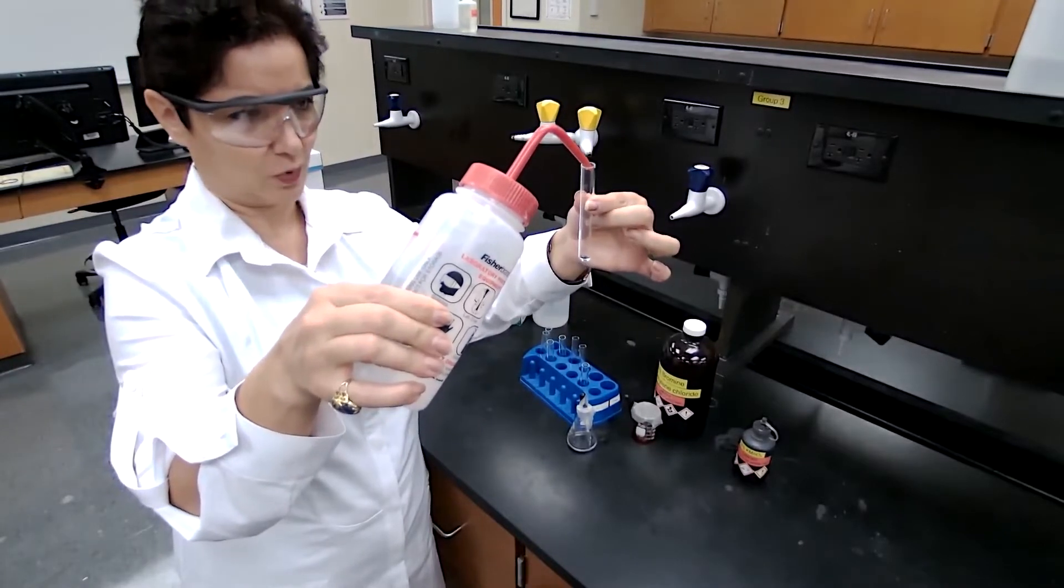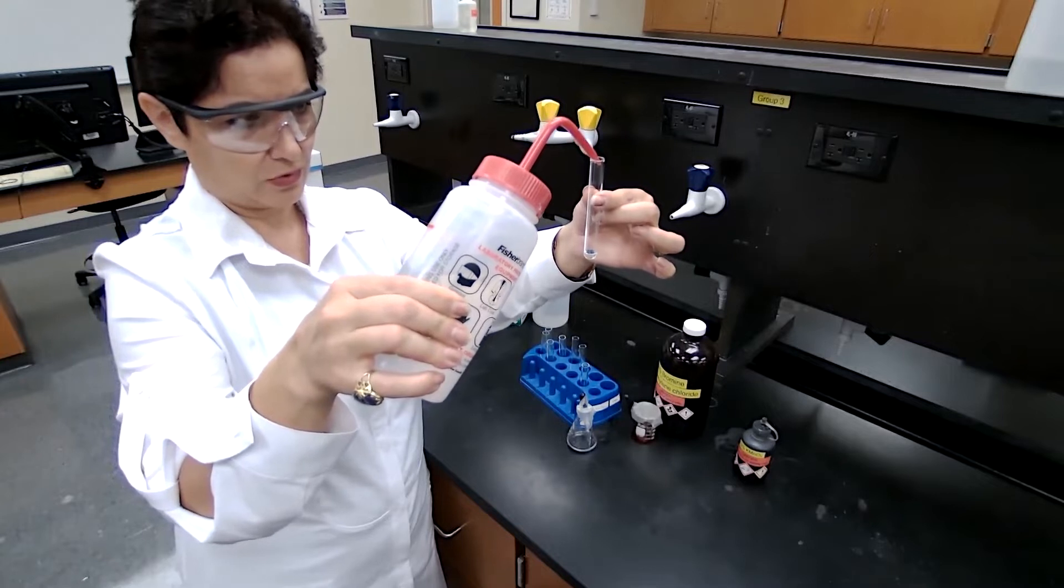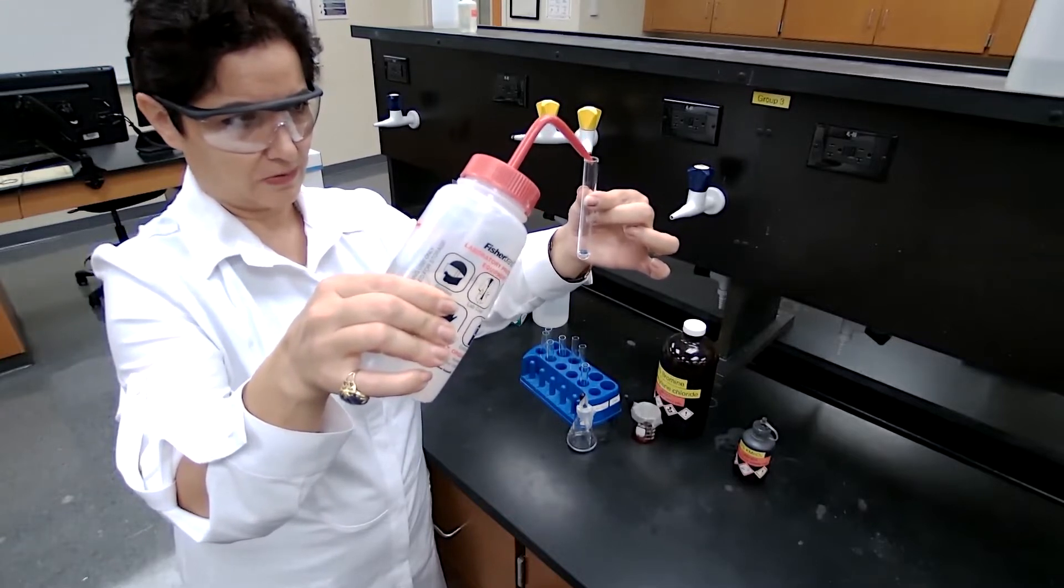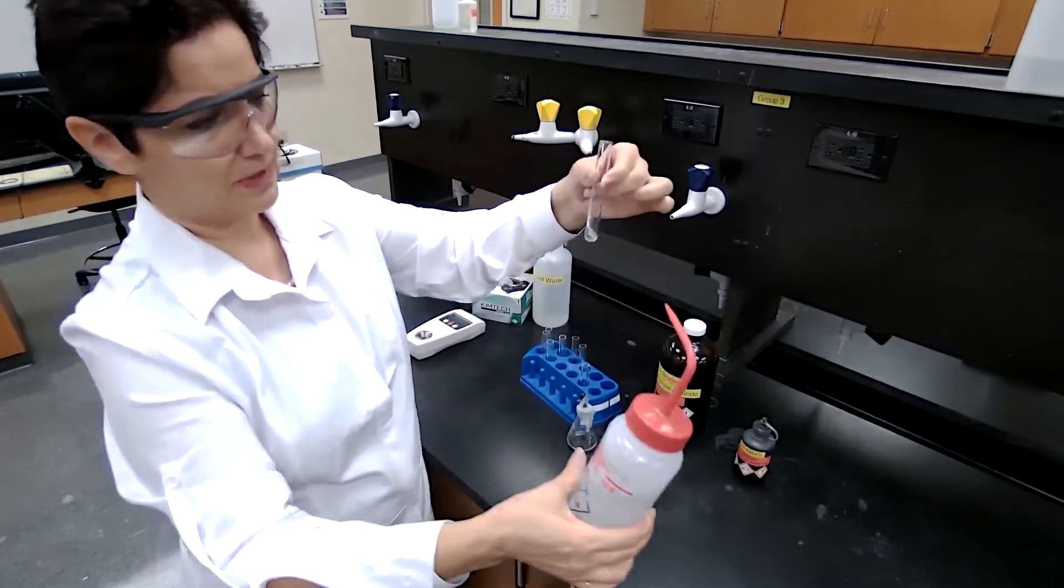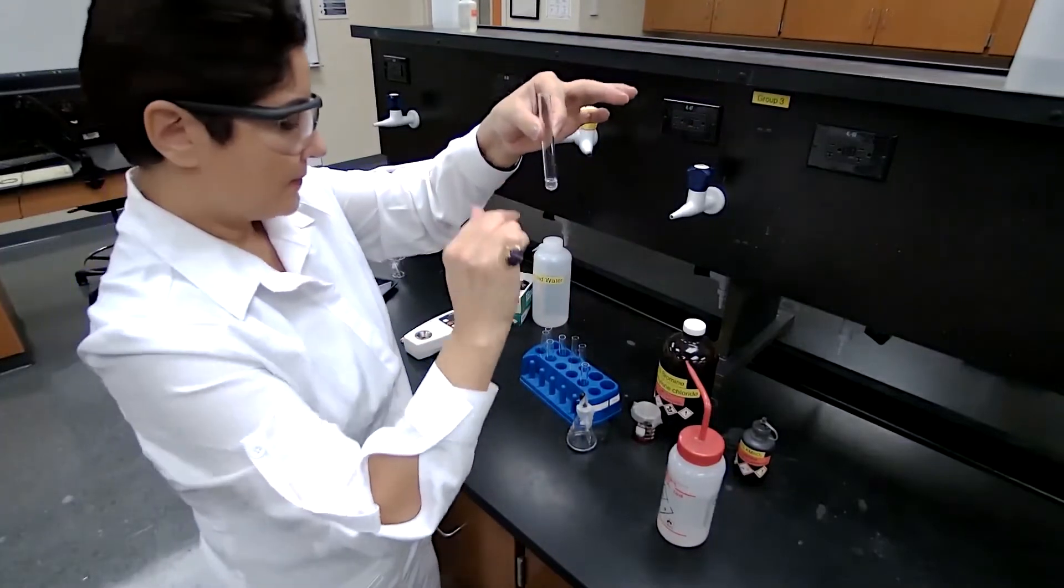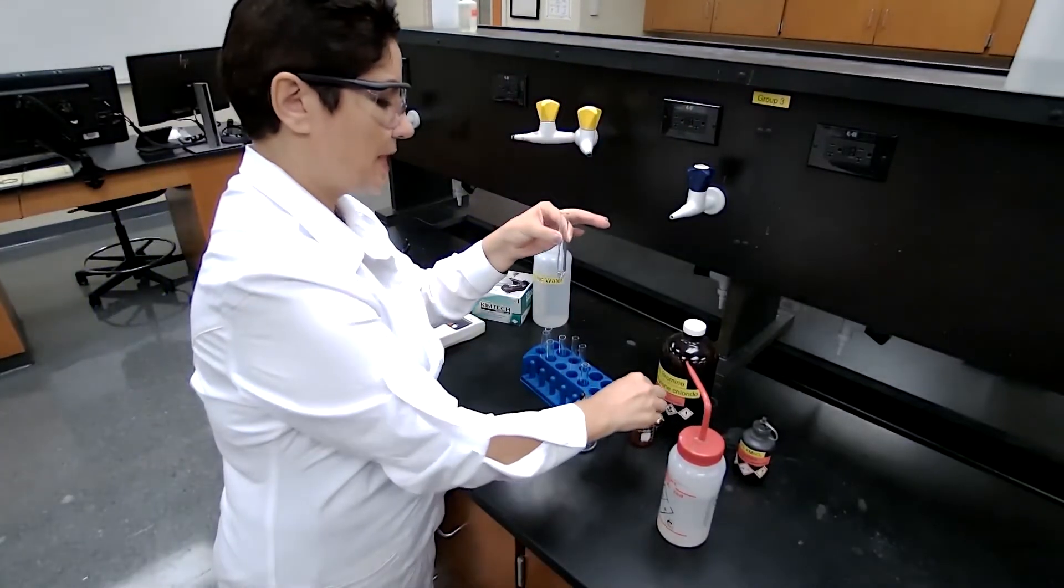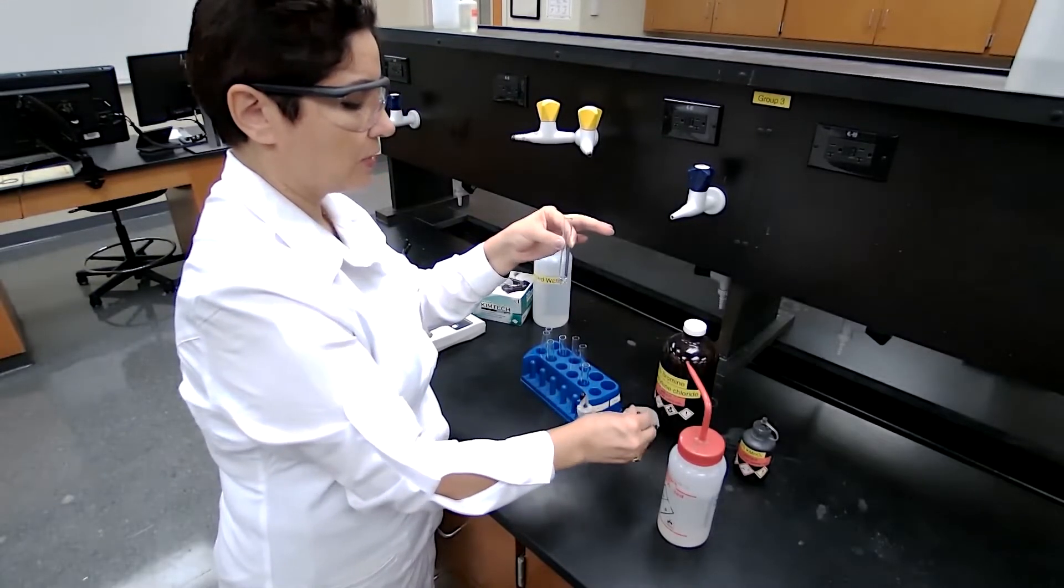You can use a dropper or carefully use this dispenser. It's about one milliliter or one centimeter height of the sample in a small testing tube. And we add one drop of the bromine in methylene chloride.